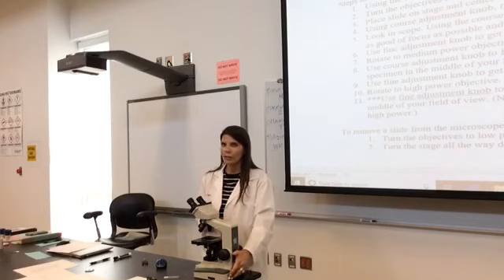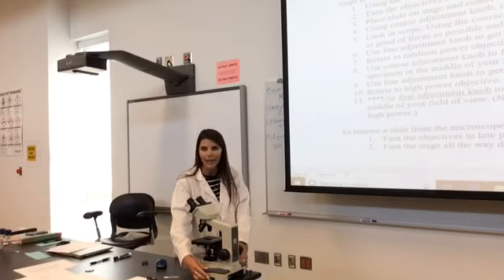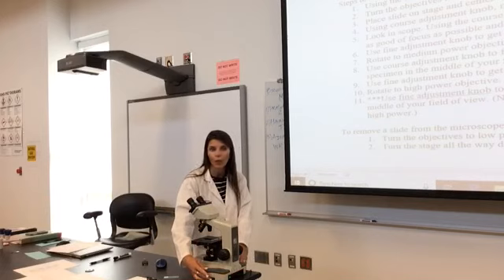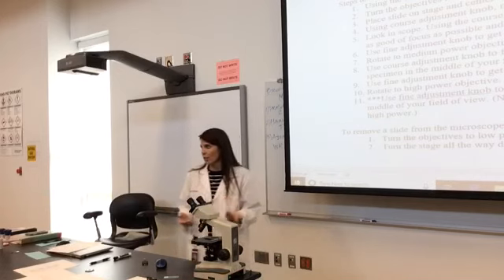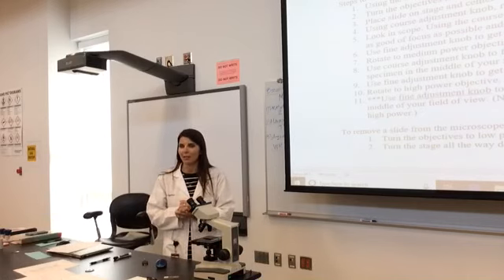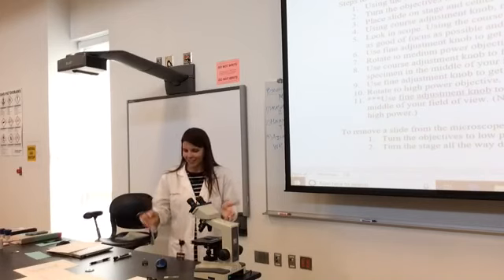I'm going to turn it on. And then I'm going to adjust the amount of light that goes through. What's comfortable for you? Okay, some of you like bright. You don't need to change it when I check it. I'll be fine. I already come to these classes knowing I'm going to leave with a headache because some of you really like bright stuff, which is fine.